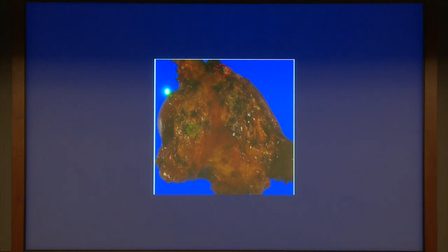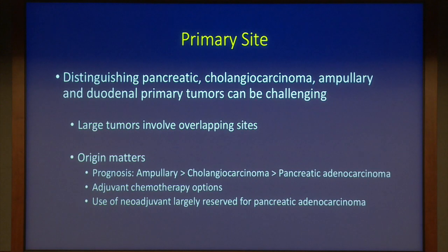In terms of the pancreatic margin, the neck margin in a Whipple, this is the posteromedial aspect of a Whipple resection, and this area here is the pancreatic neck margin. That is the pancreatic duct there. And the uncinate area here, this smooth area here is the vascular groove, which is also sometimes of interest at surgery if we've been hearing about the resectability or vessels abutting that margin. So we pay close attention to that.